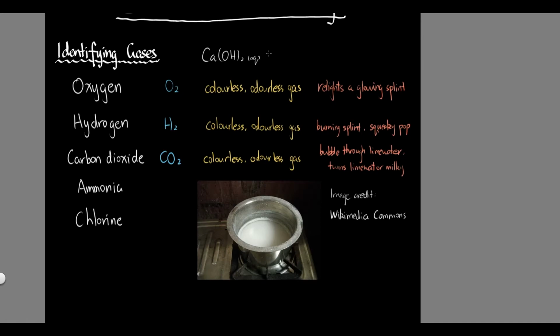or calcium hydroxide, this is lime water, when it meets CO2, which is a gas, it forms CaCO3 precipitate, so that's a solid, and if I'm not mistaken, water, H2O, a liquid. So that's basically how the lime water test works, and it forms CaCO3, which is a white precipitate as you see, and it turns the lime water milky basically.